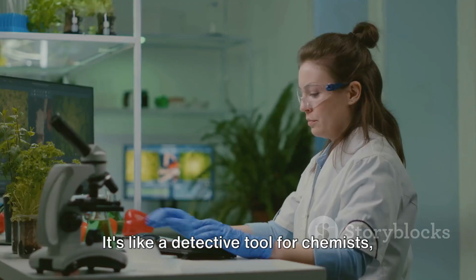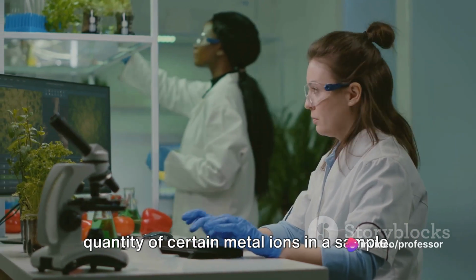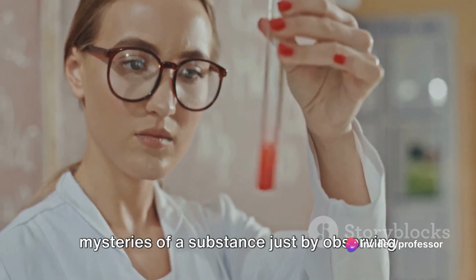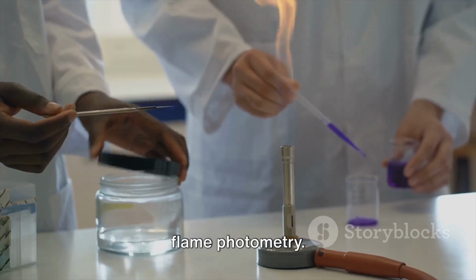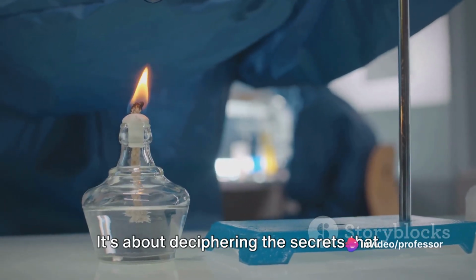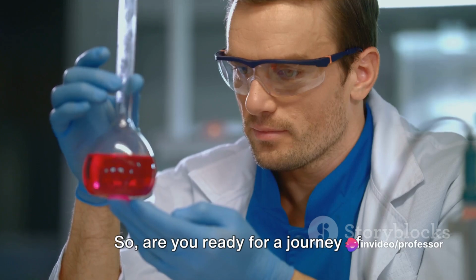It's like a detective tool for chemists, enabling them to identify and measure the quantity of certain metal ions in a sample. Imagine being able to decode the mysteries of a substance just by observing the color of a flame. Yes, that's the beauty and essence of flame photometry. It's not just about burning things and watching the pretty colors. It's about deciphering the secrets that those colors hold.